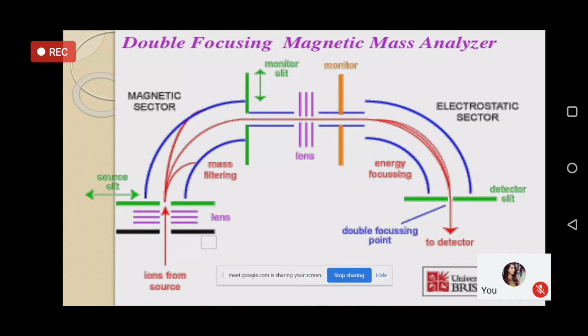What I'm choosing is a narrow beam of particles having a particular velocity range, a small velocity range. Now remember that it is not a single velocity. It is a small velocity range that we are considering. So you'll have particles with a small velocity range entering the slit, and all other particles with different velocity are lost. They are not able to reach the slit.